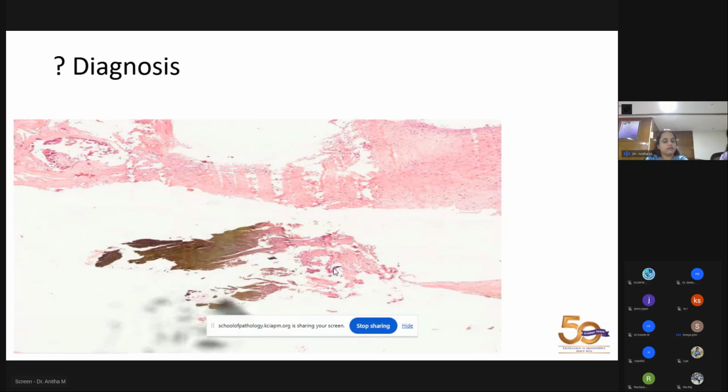You were correct. Shreya, you were correct. Can you repeat it? Yes, ma'am. Alkaptonuria, ma'am. Okay, what is the deposit? What is the disease called? Ochronosis, ma'am. Ochronosis is the disease. Yes, ma'am.